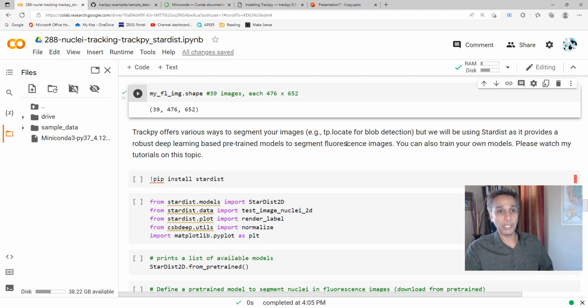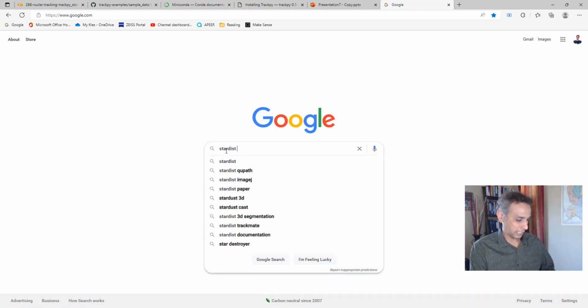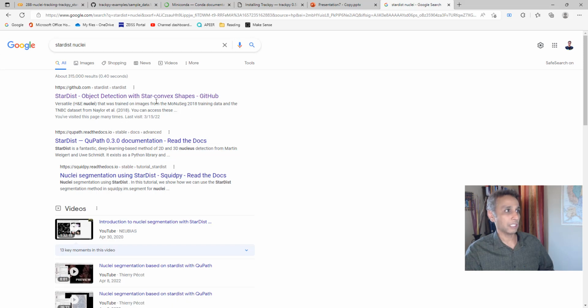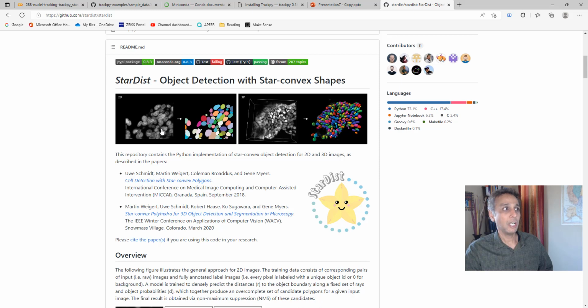You can use various methods, but we are trying to use a pre-trained deep learning model from StarDist. And in case you don't know what that is, go ahead and watch my video on this specific topic. But since you're here, let us go ahead and just do a quick Google search. Yeah, so it is an amazing library for 2D or 3D segmentation of, they call it, nuclei or star-convex shape. Think of this as a shape where if there is a point in the middle of the object from where you can see every point of the object, then this segmentation definitely works well.